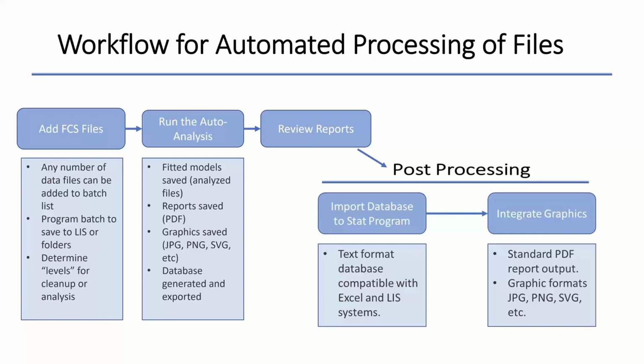You can then review the reports, check for alerts, and continue with more in-depth statistical analysis if needed. All of the results are organized in folders for you. Reports can be printed out as well as saved if desired.